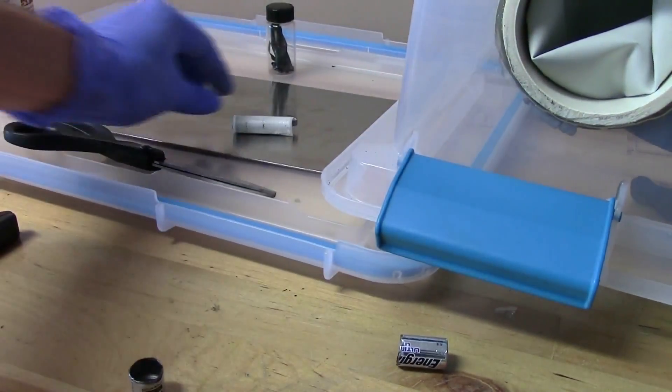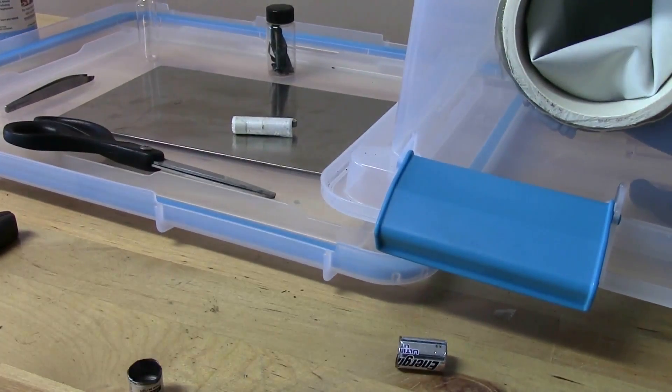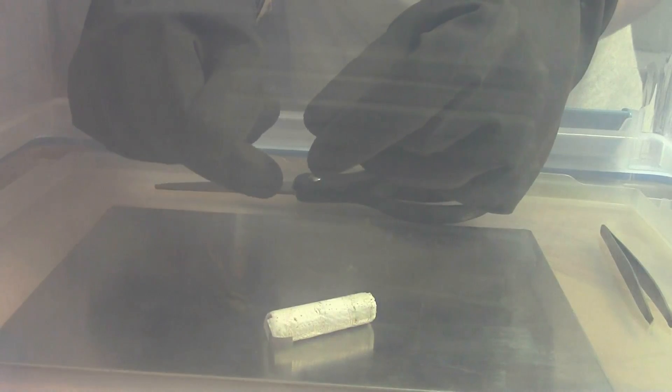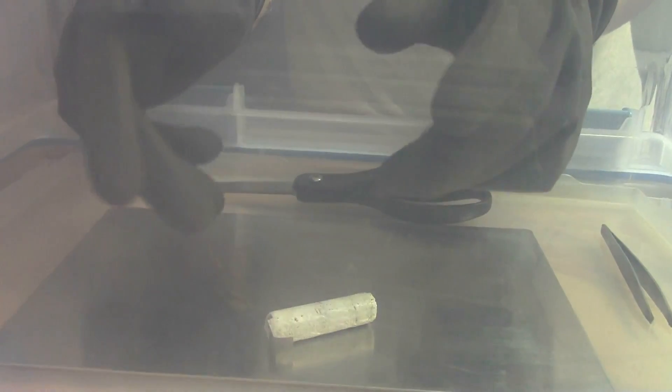All right glove box is filled with argon for about 25 minutes so that's a seven or eight volume purge so we should be good to go. Again this is the jelly roll interior of the battery and now all I should need to do is unroll it.